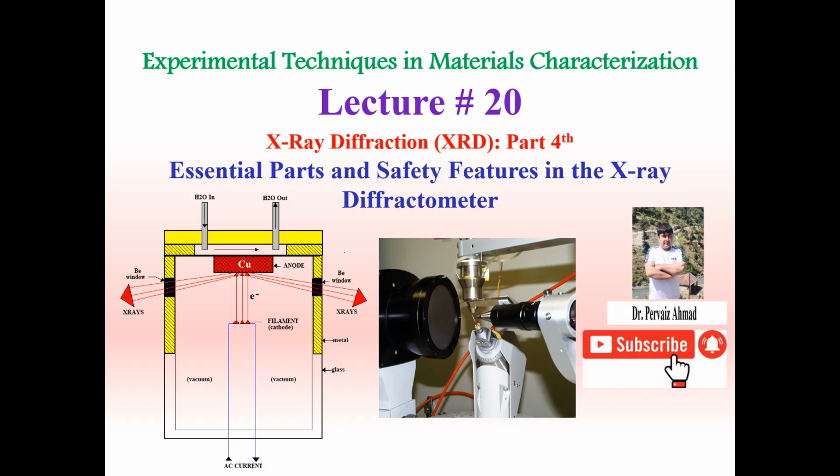Welcome to Experimental Techniques in Material Characterization, lecture number 20. It's a lecture series on X-ray diffraction, part number 4. In this part, we will deal with the essential parts and safety features of X-ray diffractometers. These are basically two parts of the lecture. So let's proceed towards the first part, which is the essential parts of X-ray diffractometers.